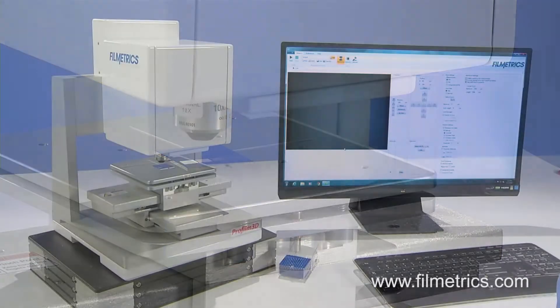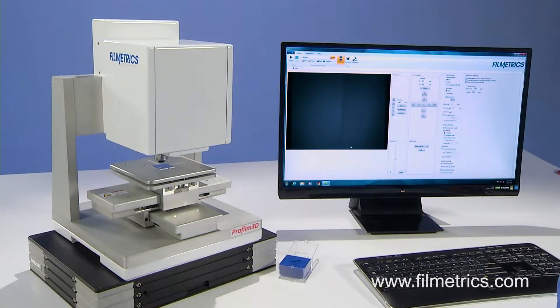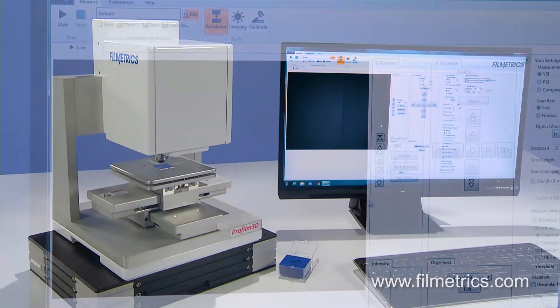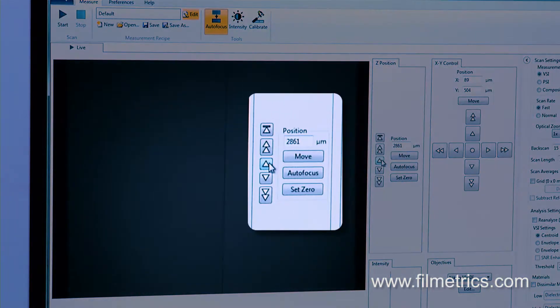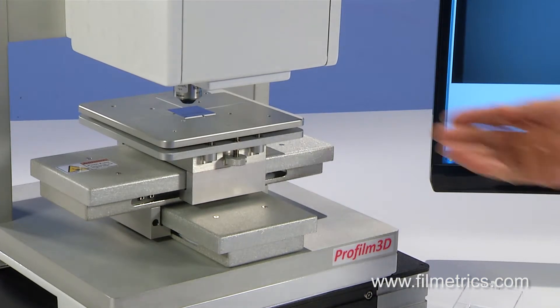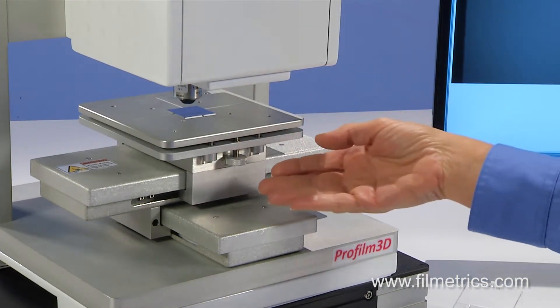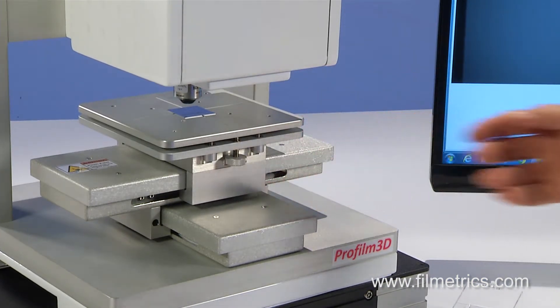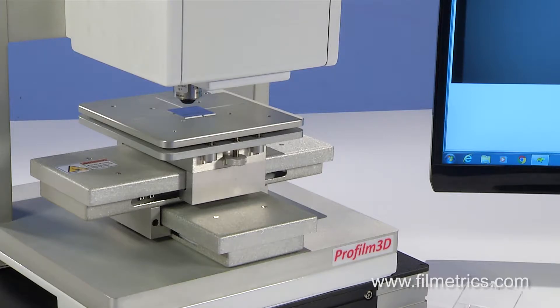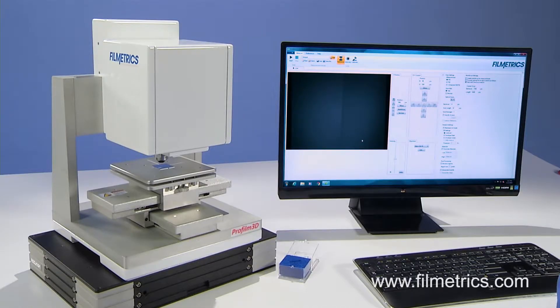Let's have a look. First, check to see that the interference fringes are suitable for making a measurement. This is done by moving the Z stage up and down to focus. If the fringes were not suitable, the tip-tilt stage would need to be adjusted until the fringes are correct. In this case, the fringes look good.